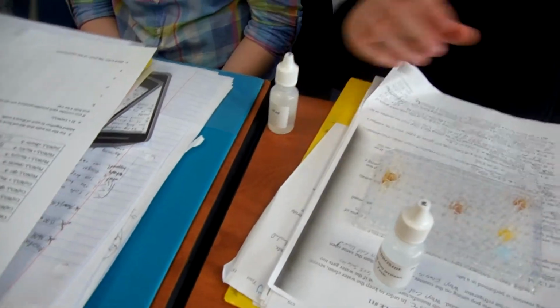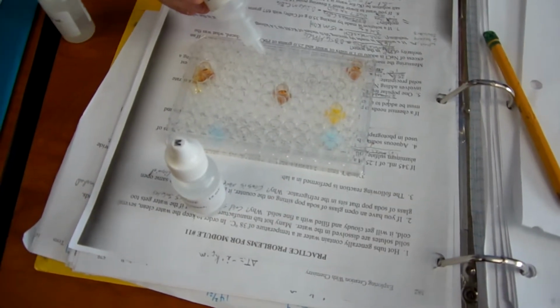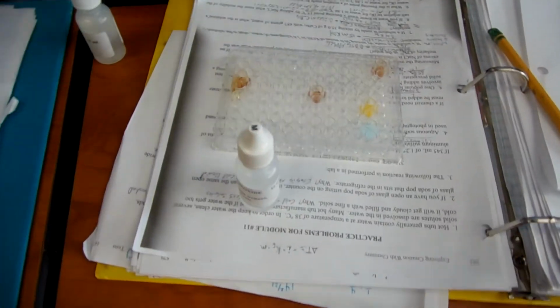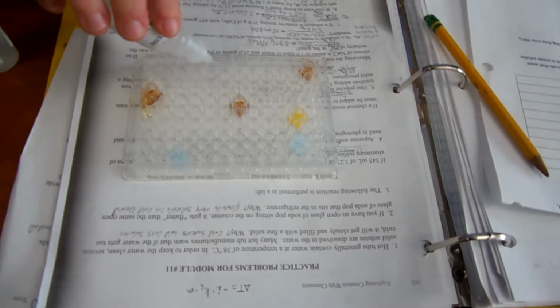Okay. Straight up and down. Two drops. Good. Of course, this is qualitative, not quantitative. We're not too worried about how much. We just want to see a precipitate. So put in the sodium hydroxide in the same well. We think we'll get a precipitate. Straight up and down. Don't touch the edge to the thing and contaminate it.